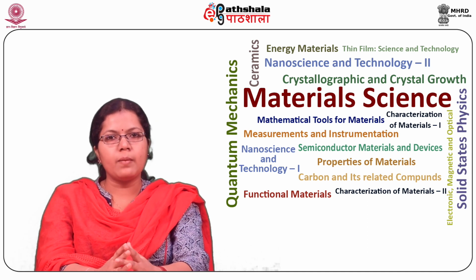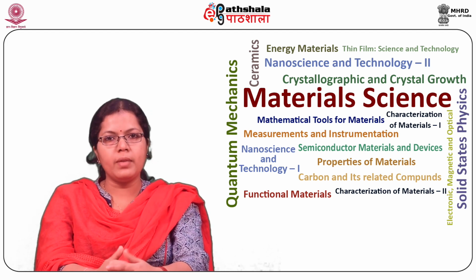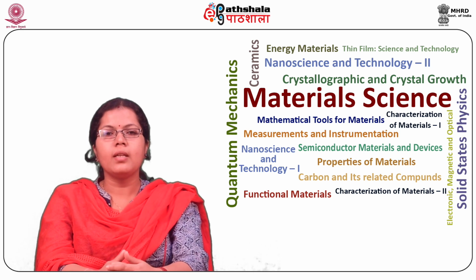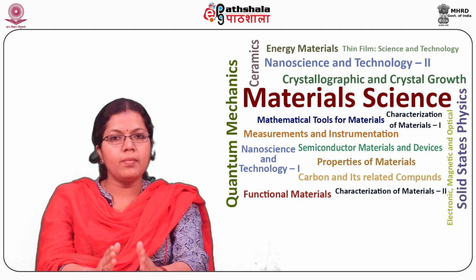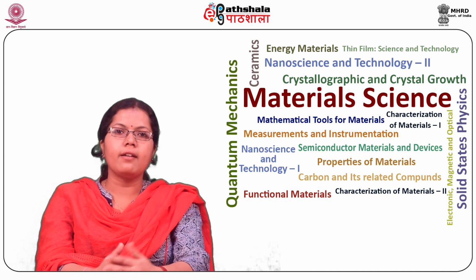The most common SEM mode is detection of secondary electrons emitted by atoms excited by the electron beam. The number of secondary electrons that can be detected depends, among other things, on specimen topography. By scanning the sample and collecting the secondary electrons that are emitted using a special detector, an image displaying the topography of the surface is created.